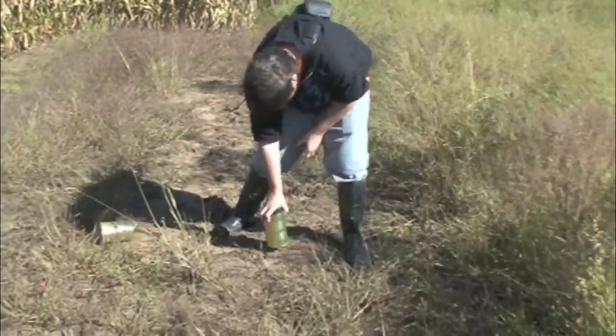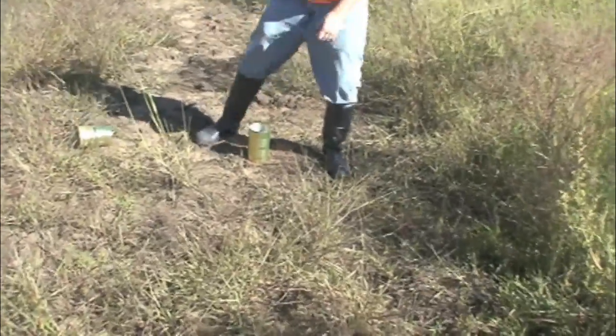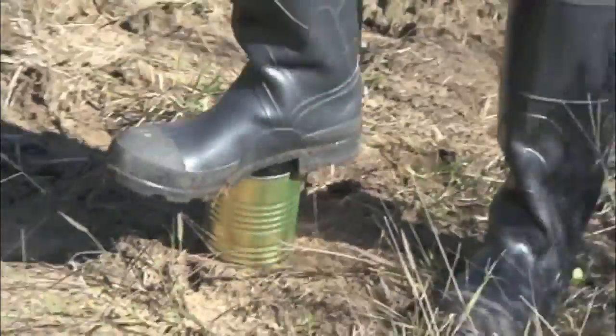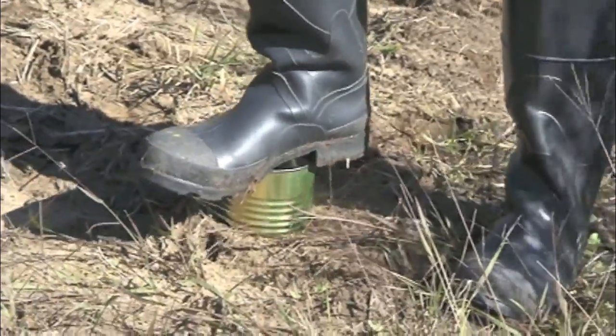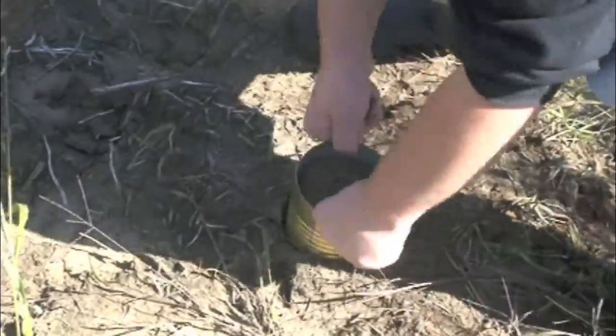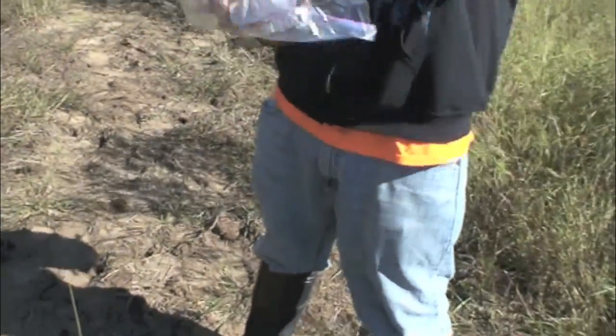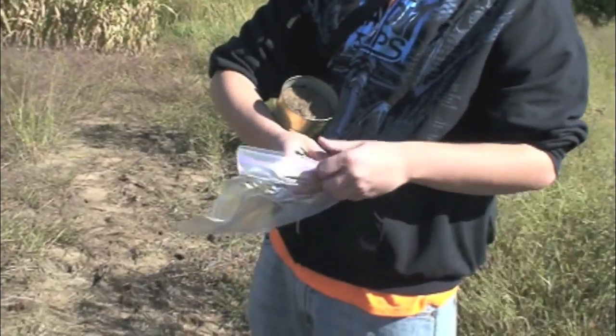One way to take a soil sample is to take a coffee can with the bottom cut out and press it into the soil, applying equal pressure to the top of the can. Using two hands, pull the can out of the soil and place the can with the soil into a one-gallon plastic bag.